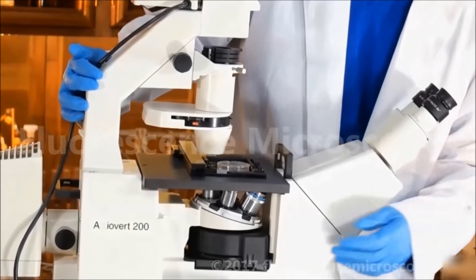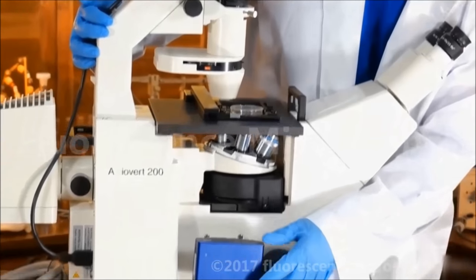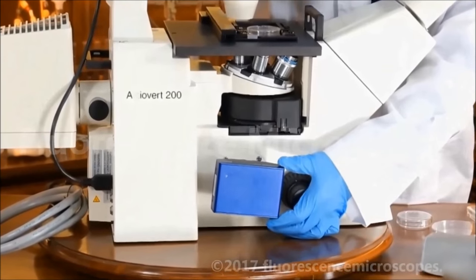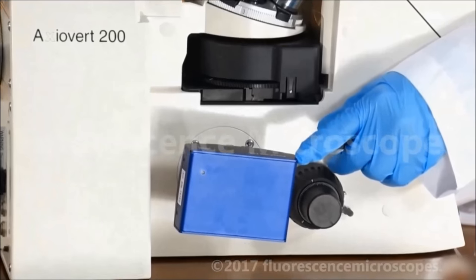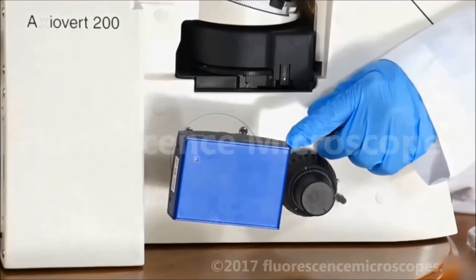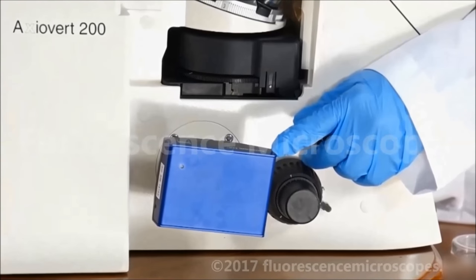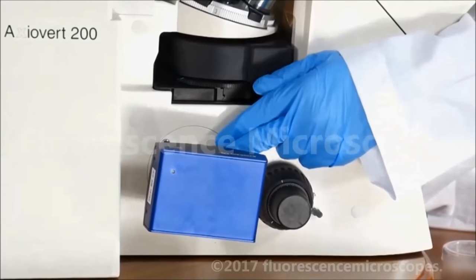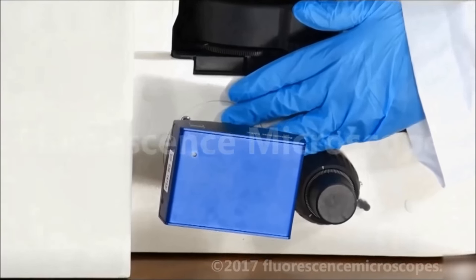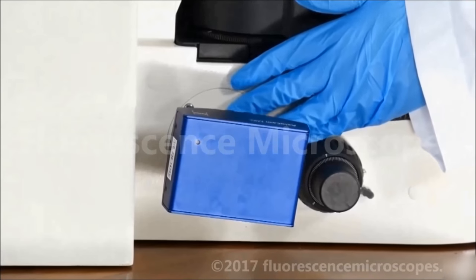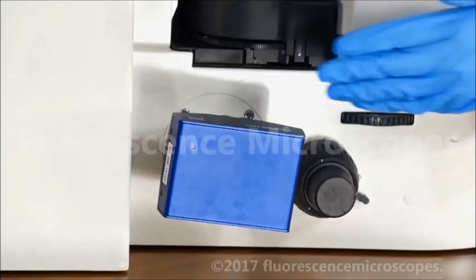We've also configured this with a camera. This camera may or may not be included with the microscope. You'll need to look at the actual ad specifications to see what, if any, camera has been included. We are including the C-mount and of course the photo port is already built into the microscope. So this microscope is completely photography capable.